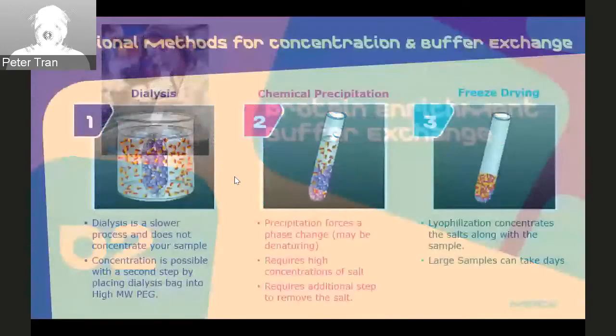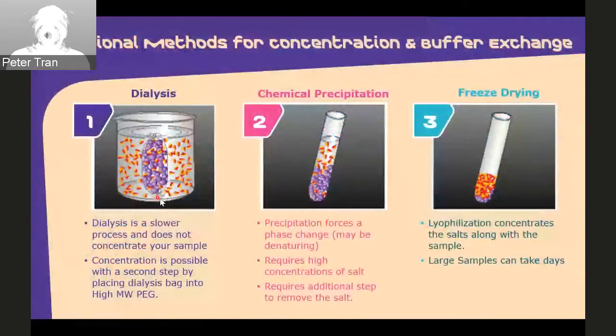Okay, what are the differences between these methods? With dialysis, you just have the sample in the tubing and then incubate with the new buffer overnight or over the weekend. It will change the buffer gradually, right? It's a very slow process.